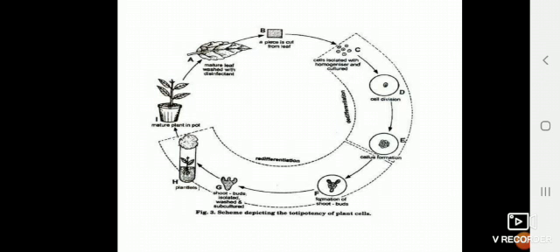Then small pieces are cut from the leaf. These cells are isolated with a homogenizer and cultured. The leaf cells were singled. Then the cell division process goes on, and the callus will be formed. Then this callus will form shoot buds. The shoot buds are isolated and washed and subcultured, then plantlets will grow, then again go for mature differentiation.